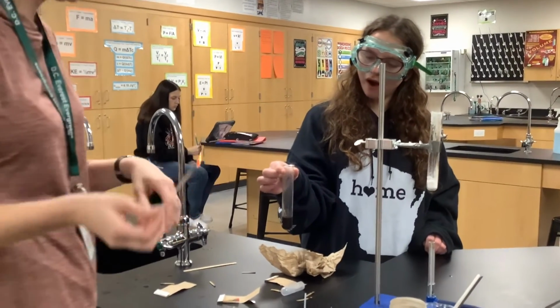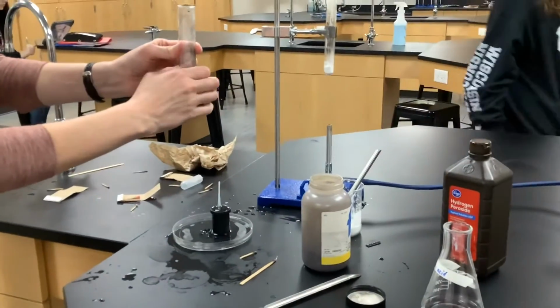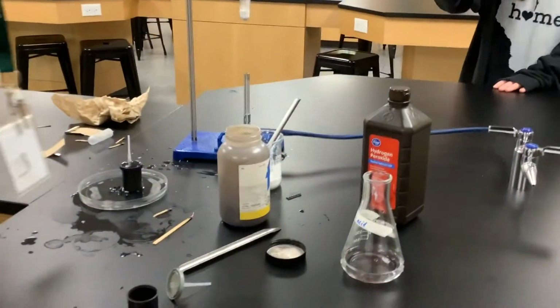But those are our 3 gas tests. Thank you very much. And do you want to feel how hot it is down here? Yeah.